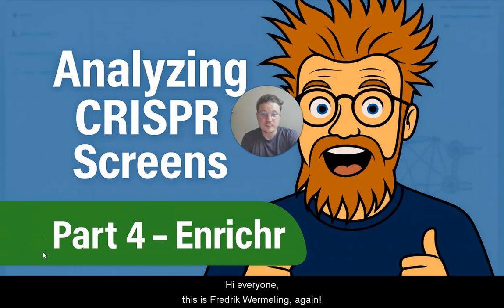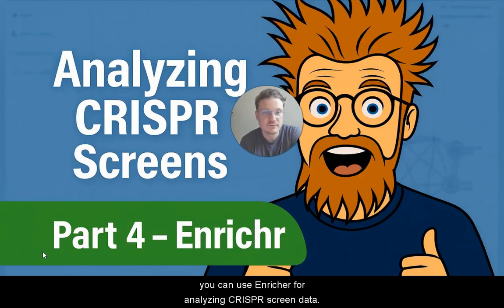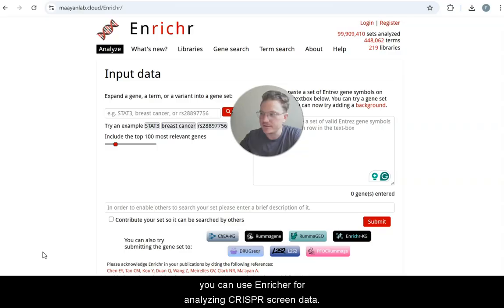Hi everyone, this is Fredrik Wormling again, and in this video we are going to look at how you can use Enrichr for analyzing CRISPR screen data.